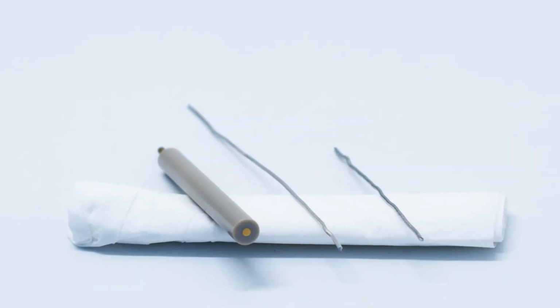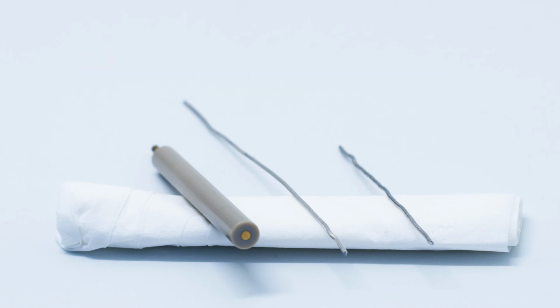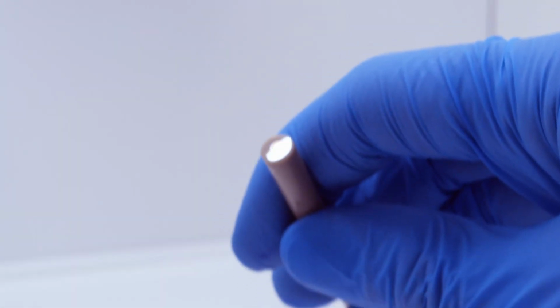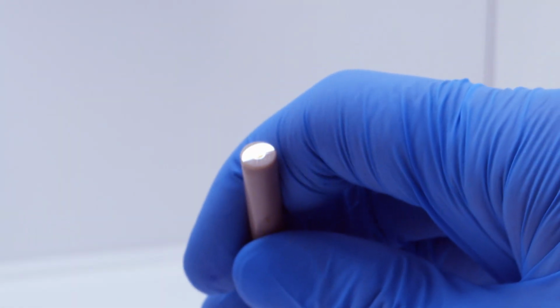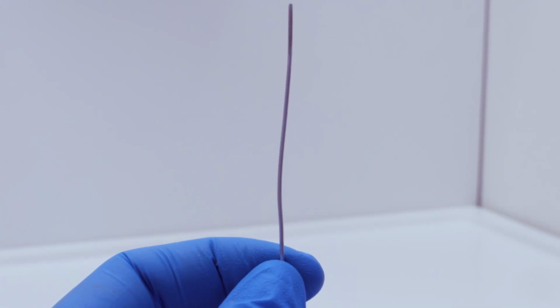As expected in electrochemistry, the choice of your working electrode, your reference electrode, and your counter electrode will be vital for the results of your analysis. So if you want to revisit that knowledge, there is a separate video on this, which is also available on this platform.